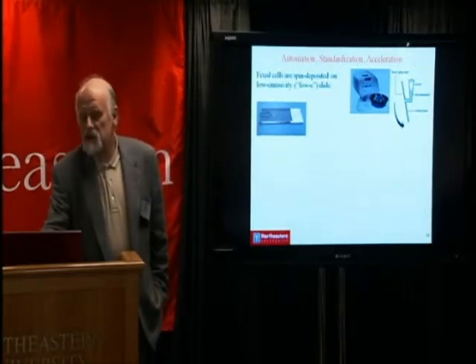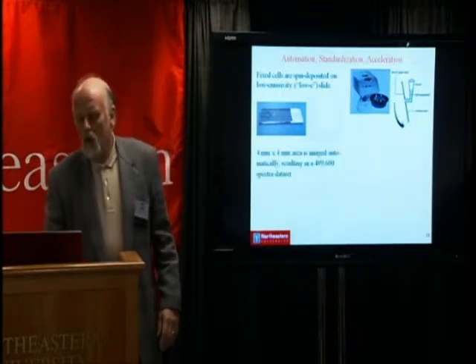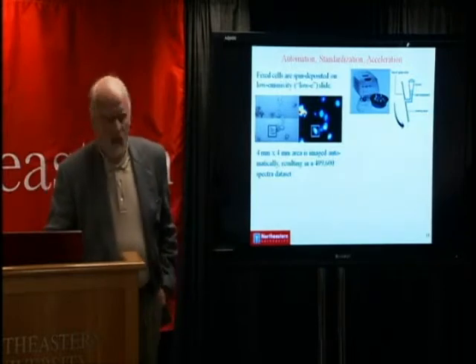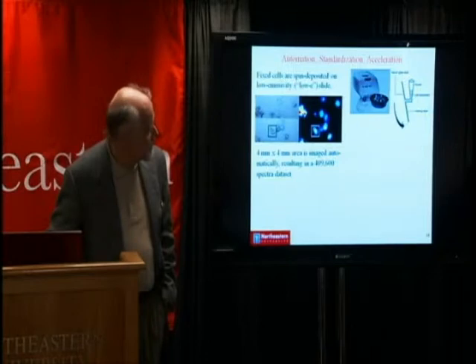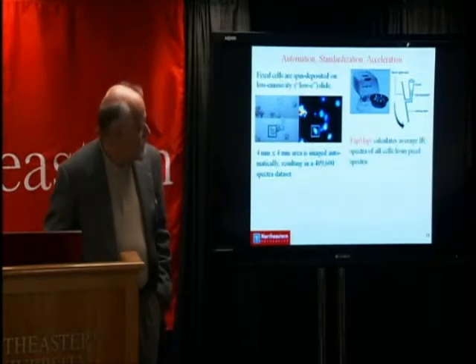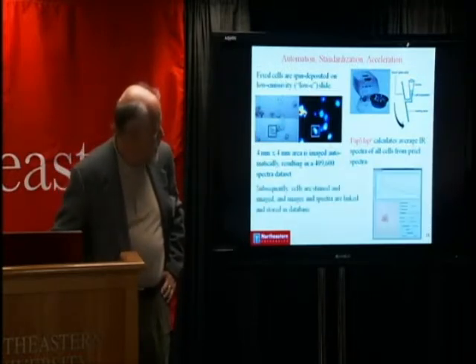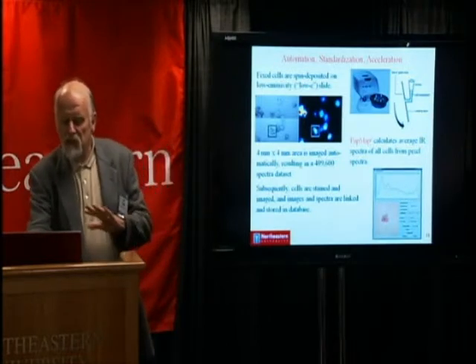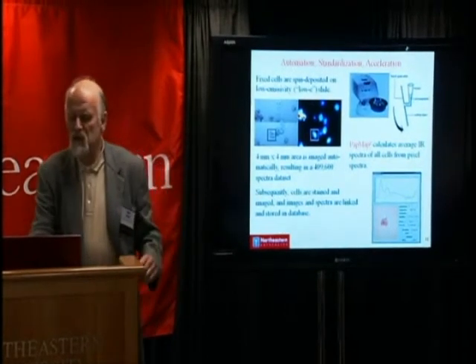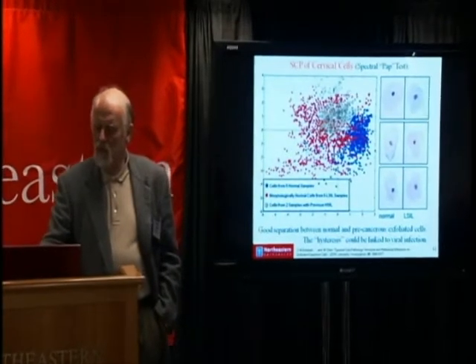So the first thing was to, instead of sitting in front of the microscope and selecting cells visually, automate this completely. We're scanning right now a large area of a tissue deposit or a cellular deposit. It gives enormous data sets. We patented this approach in 2008, and this entire method is now automated. Cells are stained, imaged, stored with the spectrum in a database, and we have collected about 500,000 spectra so far.